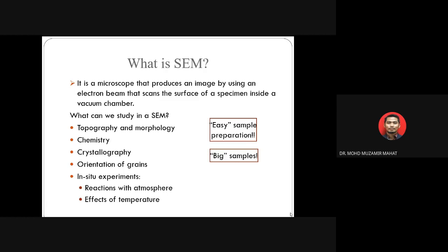And other than that, in situ experiments can also be performed these days by including some, it could be reaction with atmosphere, effects of temperature and many more. Okay.